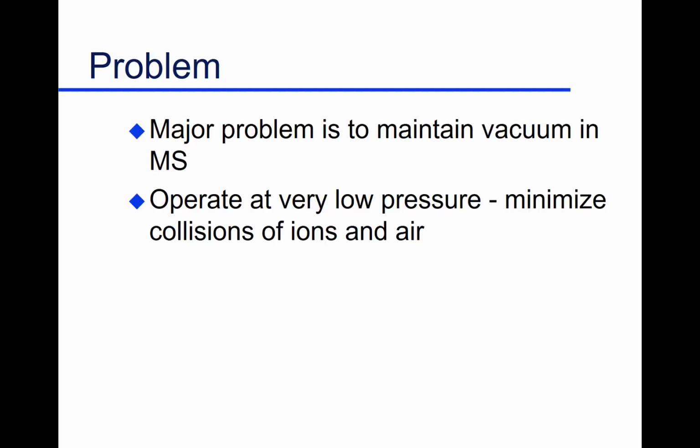You didn't get any results. So you've got to have an absolute air-free system, nothing else in there. These ions are going to collide with... That way they live long enough to be separated.